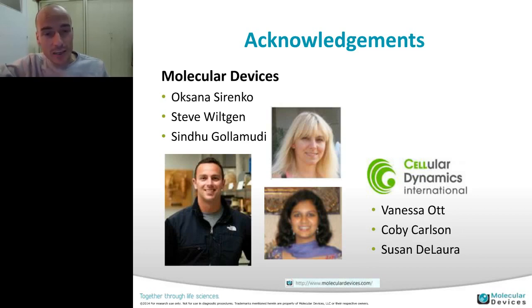And then the validations, as we have been using and are still using this enormous platform, can also be done in a very short time. And then the real time limiting step is to do all the in vivo validations, because looking for this immune system related effect takes at least a month to see effects. Doing all this with a sufficient number of animals, of course, then can occupy a certain amount of time. But the initial screen, the image-based screen, is done basically within a week.